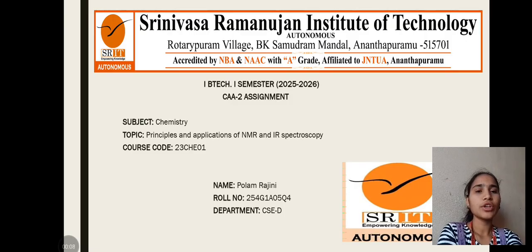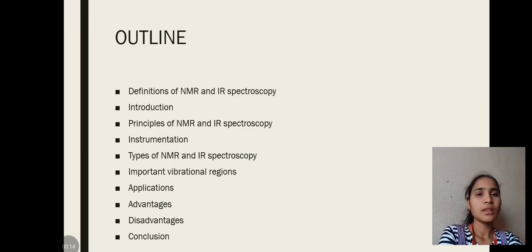Today I am going to discuss with you the topic of principles and applications of NMR and IR spectroscopy. The outline of this video presentation is definitions of NMR and IR spectroscopy, introduction, principles, instrumentation, types of NMR and IR spectroscopy, important vibrational regions, applications, disadvantages, advantages and conclusion for NMR and IR spectroscopy.